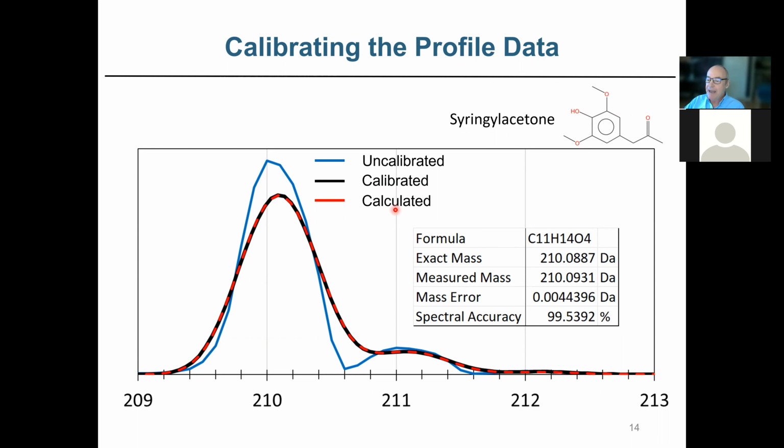Pretty simple. Now, if I take the uncalibrated spectrum and use our calibration mechanism, we obtain the calibrated spectrum, which we now have calibrated to a known peak function. So we can use the calculated spectrum of the same peak function, and now we can overlay them and compare them very precisely. And this is actually real.